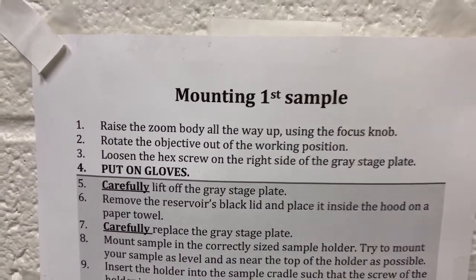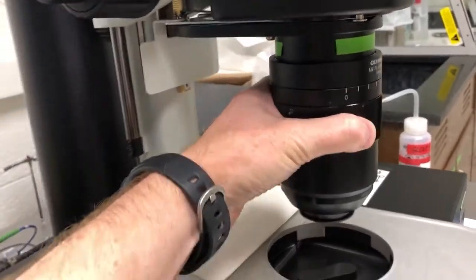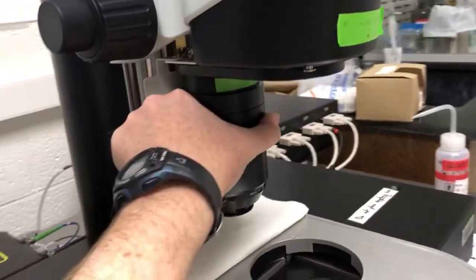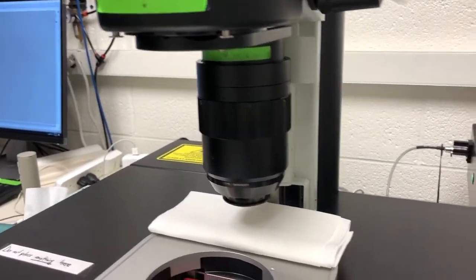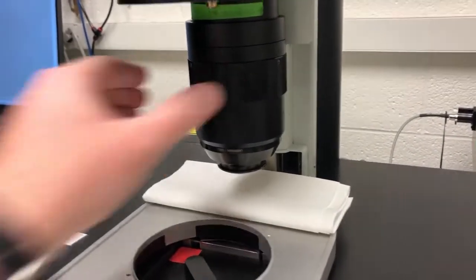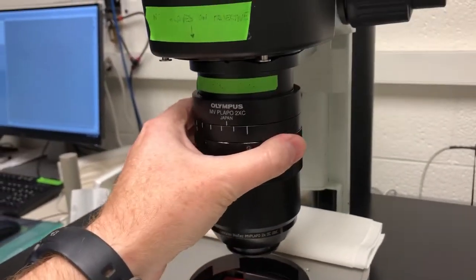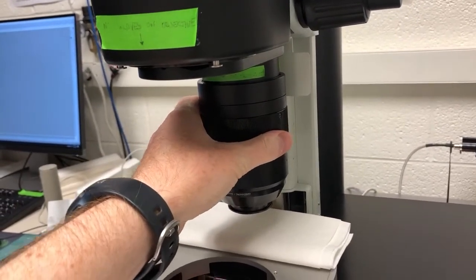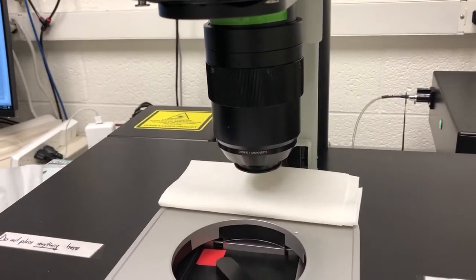Step two is to rotate the objective out of the working position. This is the objective, and the working position is aligned on top of the reservoir. It should be left out of the working position. That step is there to remind you to check in case the last person forgot. You can rotate it in either direction — it clicks into place, and when you rotate it by hand, you'll feel the click very clearly.